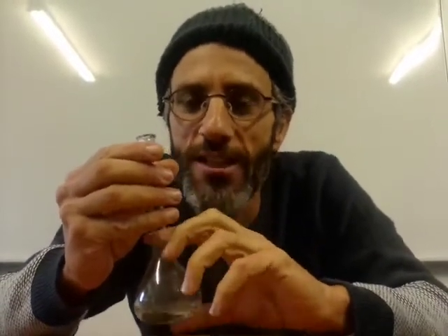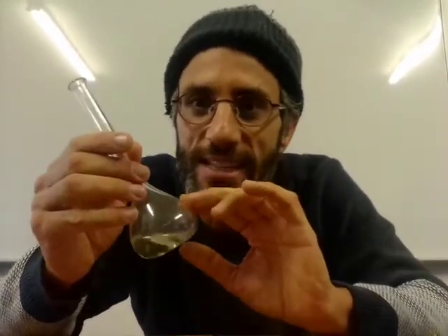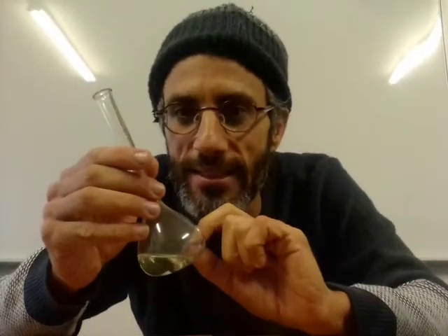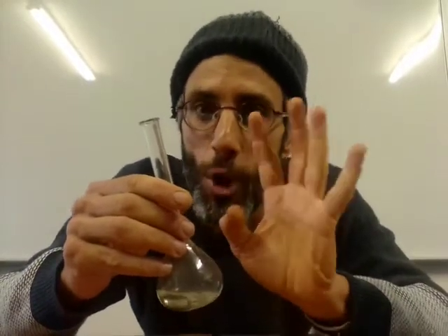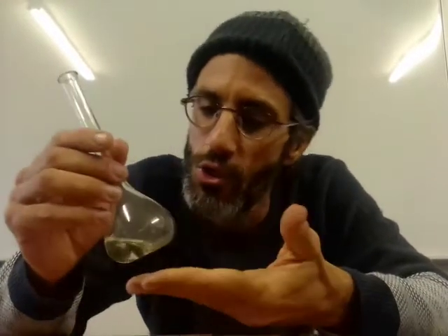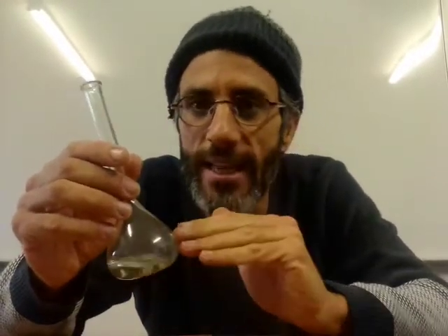And one of the things that we're going to do in this acid and base chapter, we're also going to learn how to identify gases. So the gas, guys, that was released here is hydrogen. The way to identify hydrogen is to put a flame, and the flame will create a pop, which is basically a mini explosion. We create a small explosion here. Hydrogen is a very flammable gas. So metals inside acid will release hydrogen.